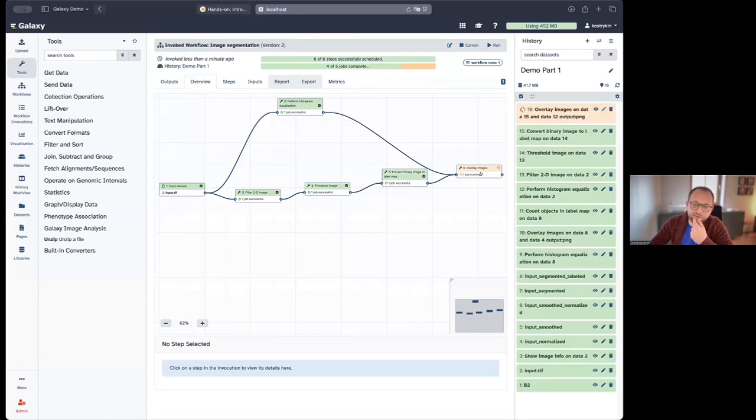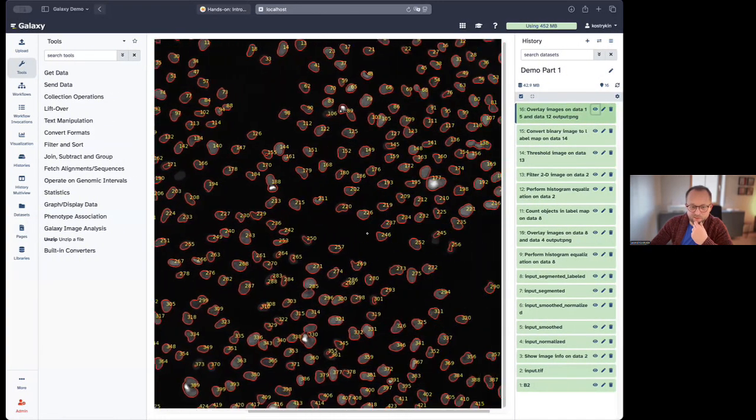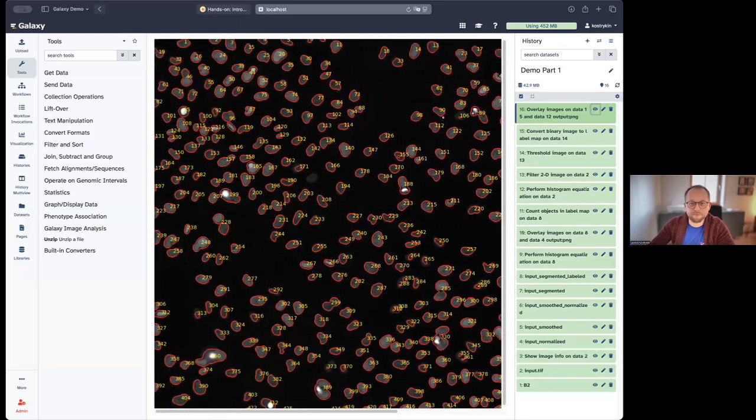And the image that I will receive from the execution of this workflow should look the same as the image that I have produced using my manual analysis. Yep, this is what it looks like. We still have this object labeled 425 at the lower bottom. So yep, it looks pretty much the same.